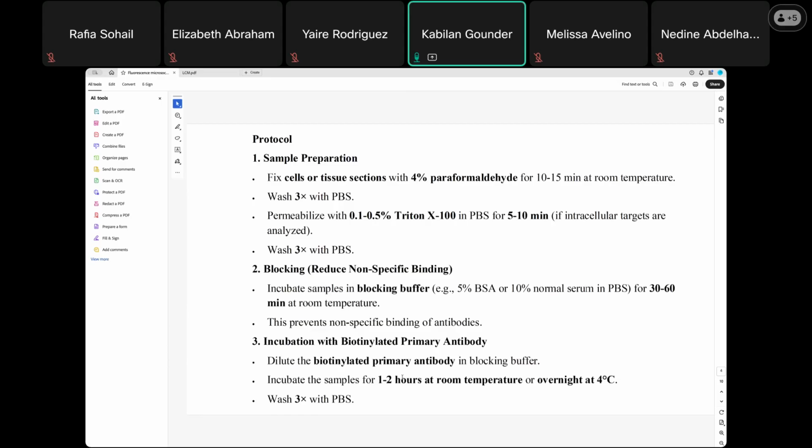The direct protocol we already discussed: sectioning, fixation, dehydration, infiltration, embedding, and sectioning are the same. If you fix your sample with paraformaldehyde. For fluorescence microscopy, the ideal is cryo fixation. If you fix your samples with liquid nitrogen, that is the preservative.